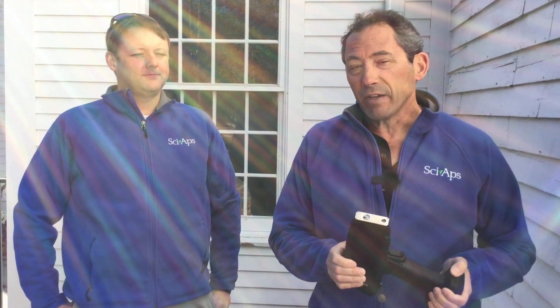We're here at this old church on a beautiful fall day in Massachusetts just to do a little field testing, talk a little bit about this analyzer, and rebuke what some of the competition is saying about it. We introduced this lead paint analyzer about six or seven months ago. It's an X-ray tube system, which means there's no radioactive isotopes in it — it uses an X-ray tube, an electric current means of generating X-rays.